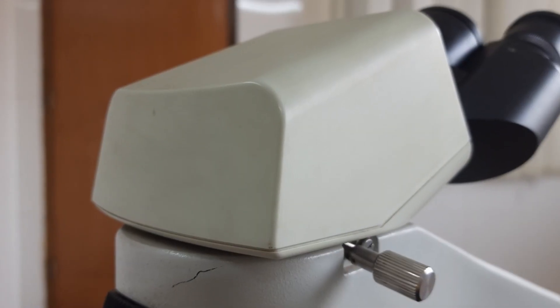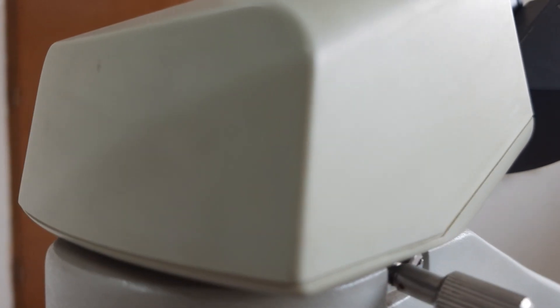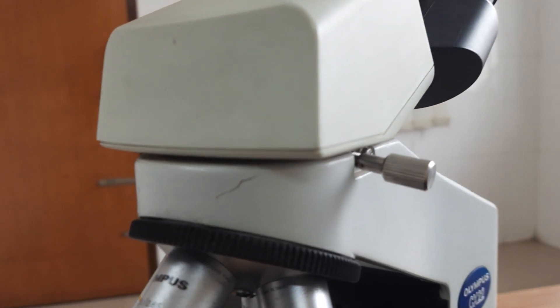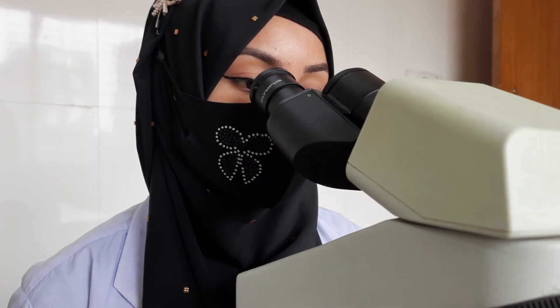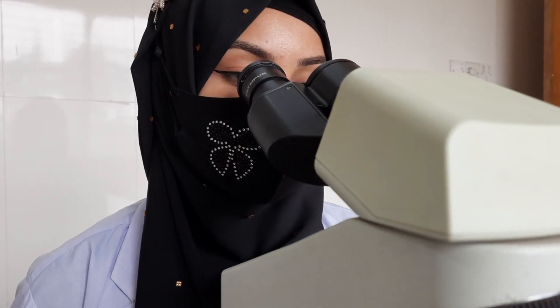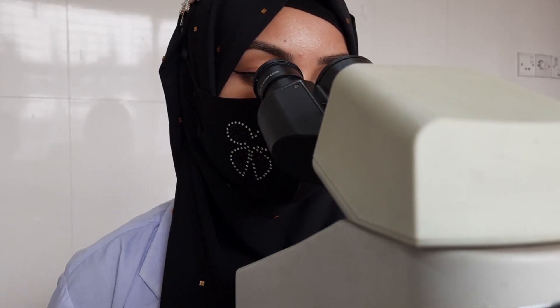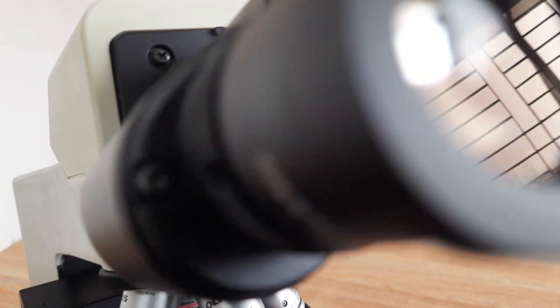The head, also known as the body tube, houses the microscope's optical components. The eyepiece and objectives are located in the head, just like we have our eyes located close to the head.